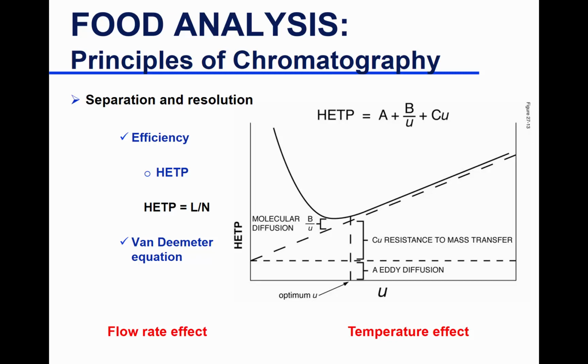So you would reach equilibrium faster. So also oftentimes we regulate temperature in LC world, not only in GC, but in liquid chromatography, we increase the temperature a little bit to reduce the viscosity of the mobile phase and enhance the movement, quickening the movement of your solute.